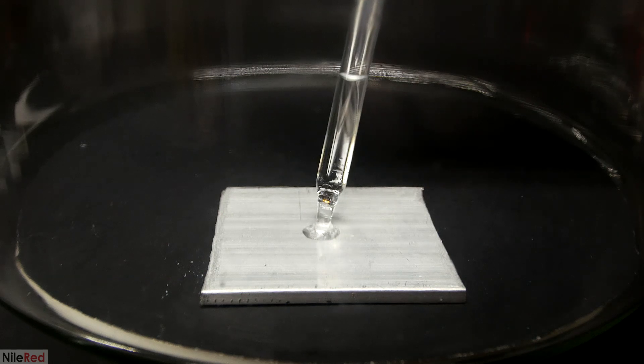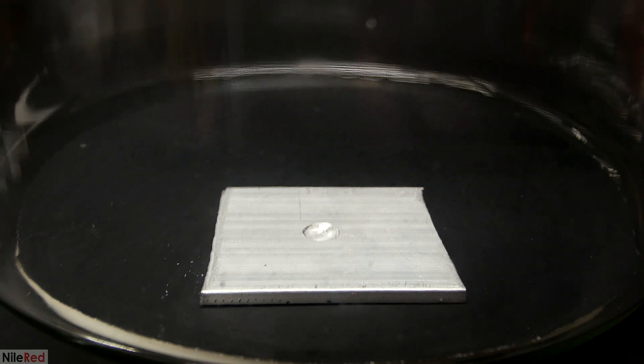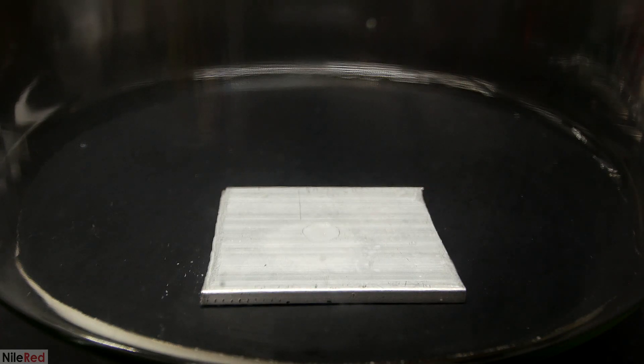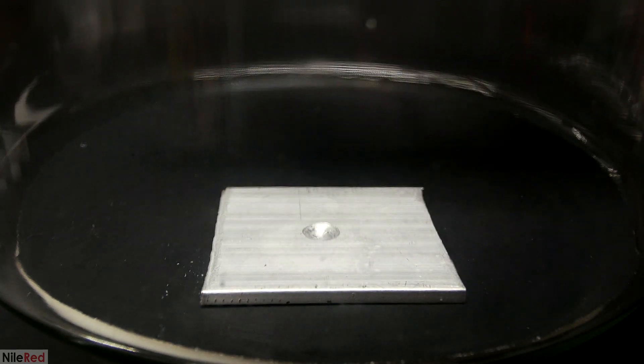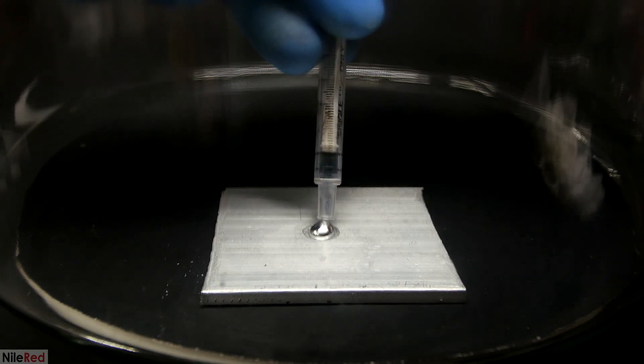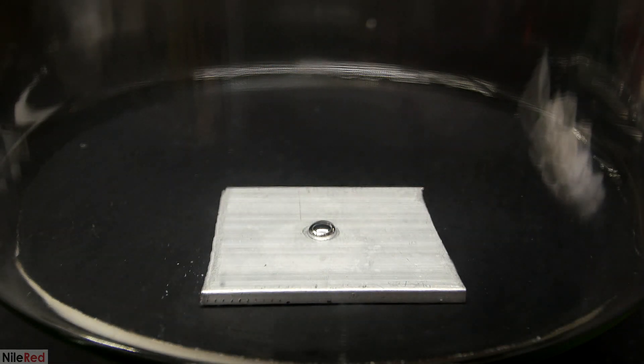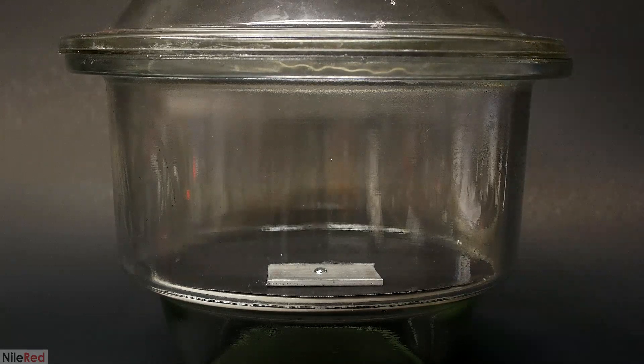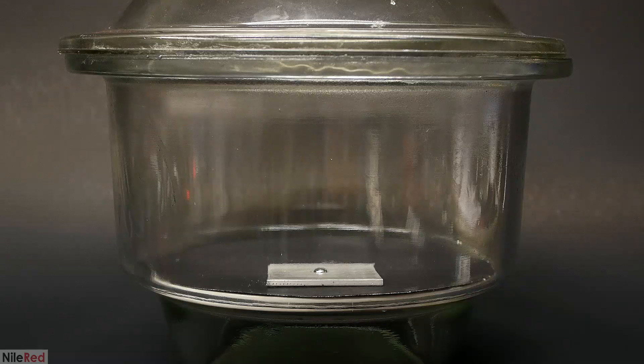So to test this out, I need to run it in a vacuum chamber. The rest of the setup is exactly like before though. I drill a hole into an aluminum plate and I treat it with hydrochloric acid to get rid of the protective oxide layer. Then I quickly add the mercury and I close the chamber. I don't show it here, but I also attach my vacuum pump to an adapter at the top.